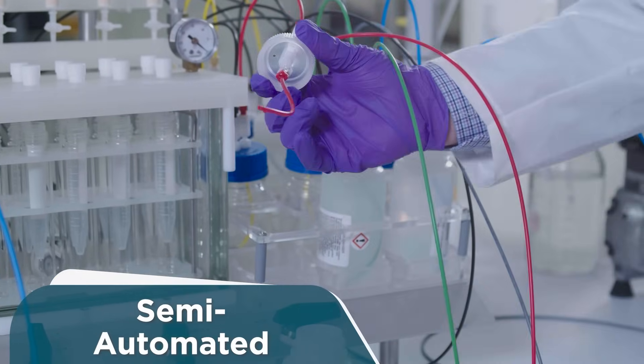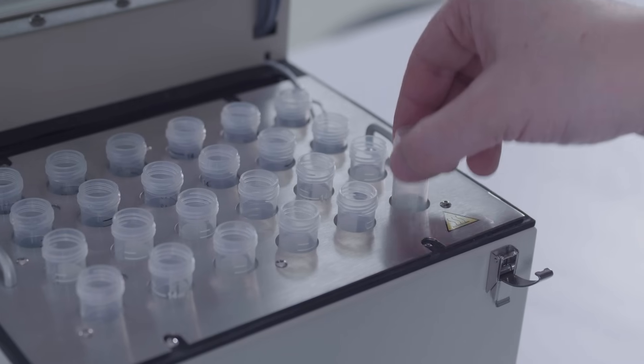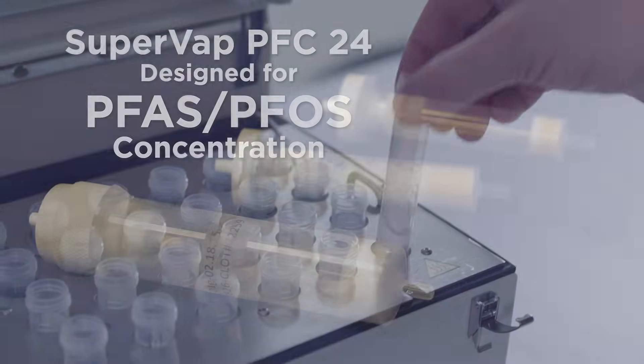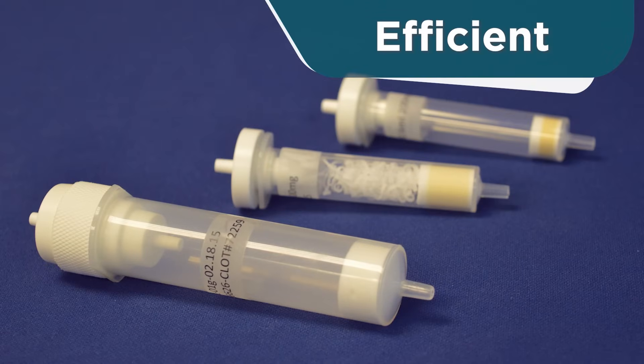Extraction, bottle rinse, in-line drying, and direct-to-centrifuge file ready for concentration. Uses all SPE cartridge sizes.